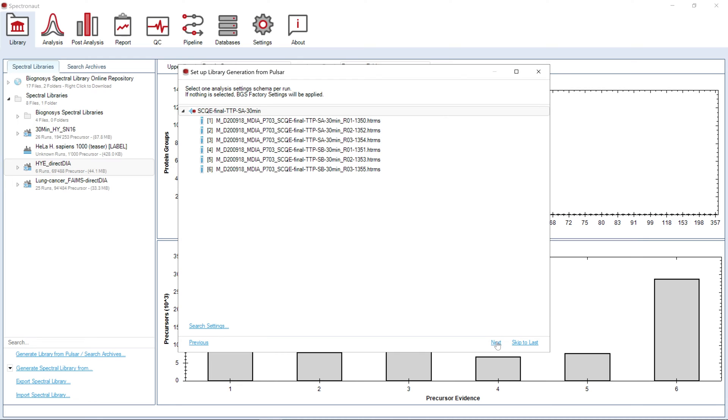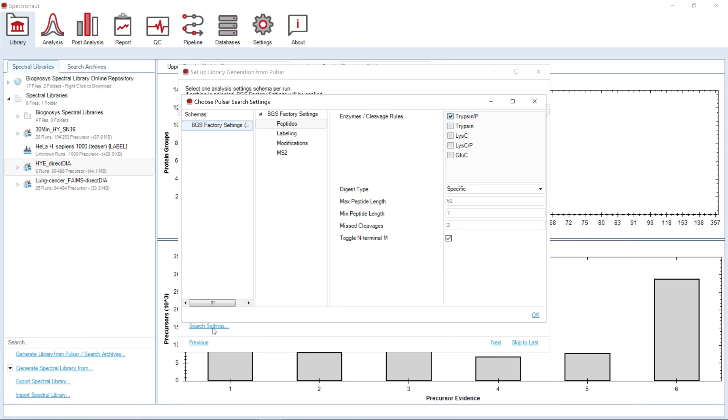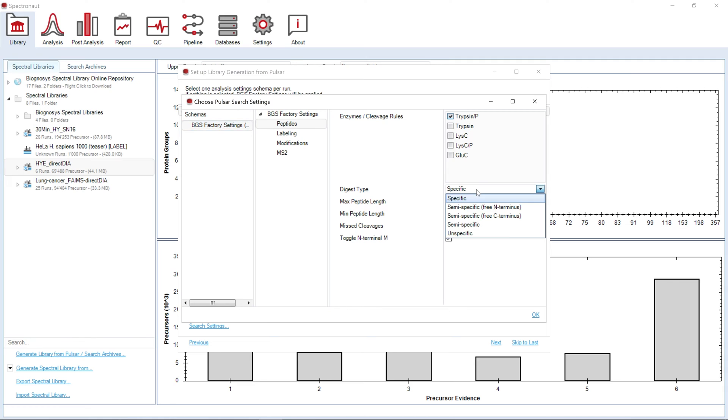Now we can set up specific search settings for Pulsar. We can select the enzyme used for protein digestion, its specificity, expected length of the peptides, and number of miscleavages. Here you can also choose to perform a search with an unspecific digestion.